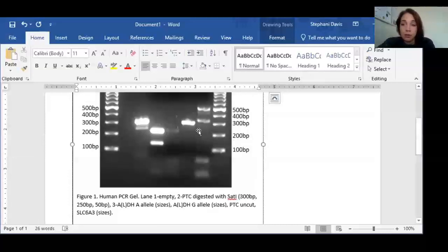So some of you, actually everyone, will probably see 2 bands if the PCR worked out well. One that you inherited from one parent and you inherit a different set of repeats from the other parent since you're diploid. Now, it seems like every PCR also has these 2 lower bands. That could be some non-specific binding or some serious primer dimers going on.